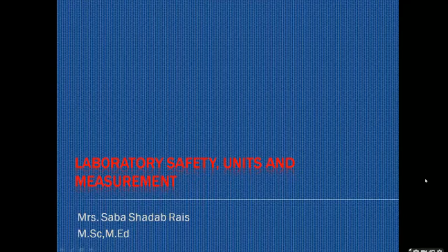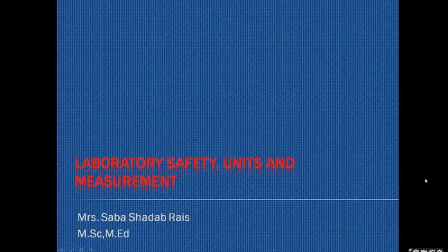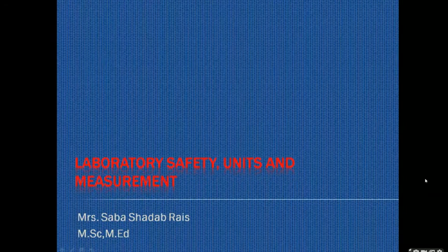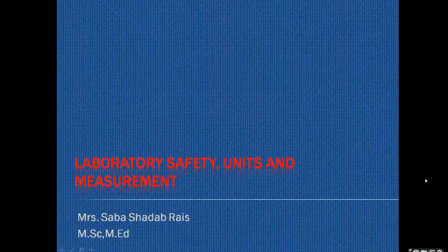So, good morning, everyone. Today, we all will talk about laboratory safety, units and measurement. Laboratory safety means here we are going to talk about the practices which we are going to use in the laboratory as well as the things required in the laboratory. That means we require to do lots of calculation and measurement.